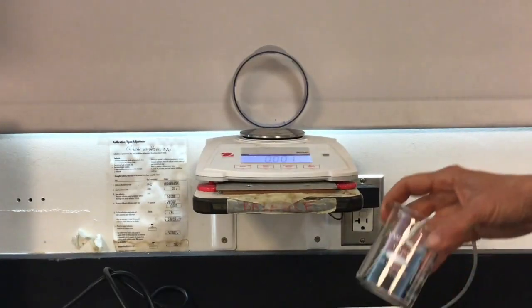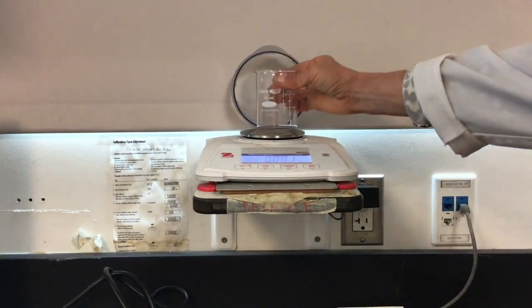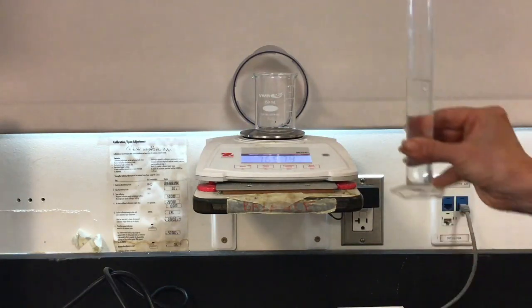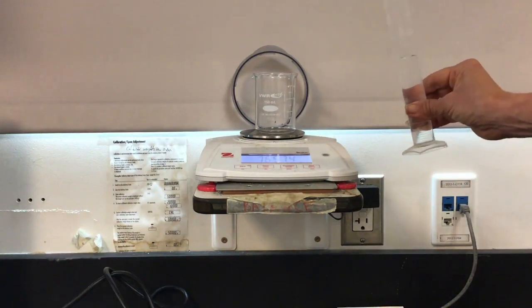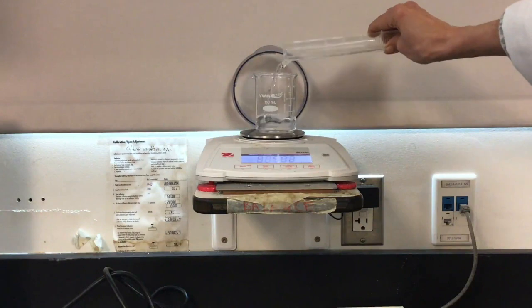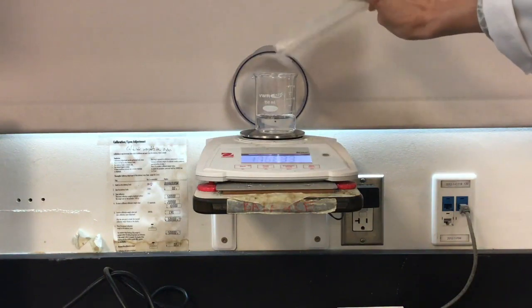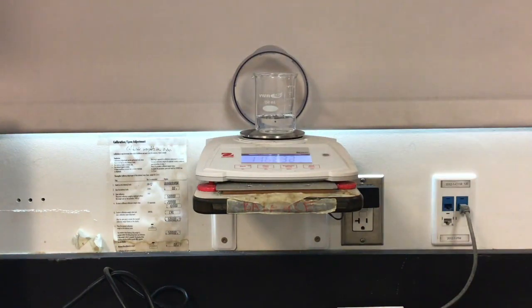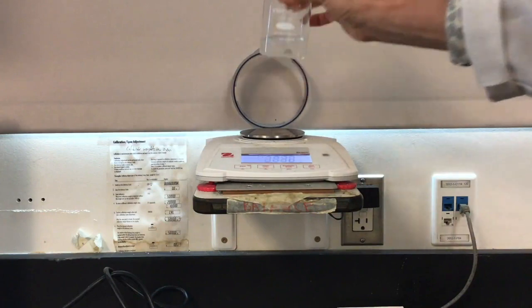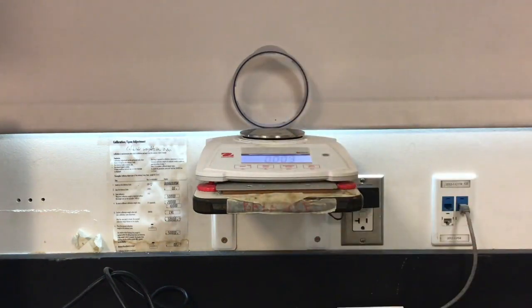To make our solution for part A, we're going to start by weighing an empty, clean, dry 150 mL beaker. To that beaker, we're going to add 40 mL of deionized water. The volume doesn't have to be that exact because what we care about is the mass of the water that we'll be using to calculate our mass percent of our solution. So you'll record the mass of the beaker plus the water, and then you can calculate the mass of your water by just subtracting the mass of that empty beaker.